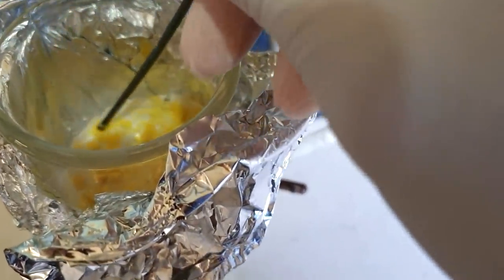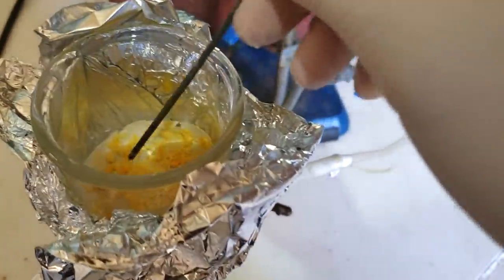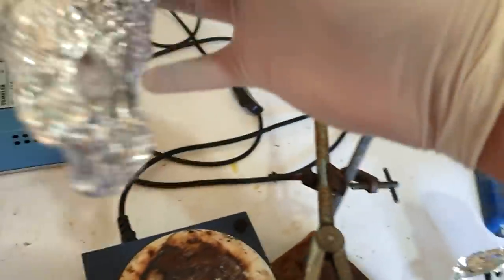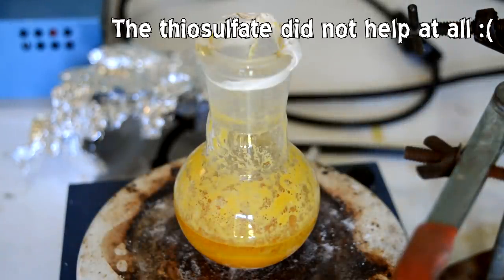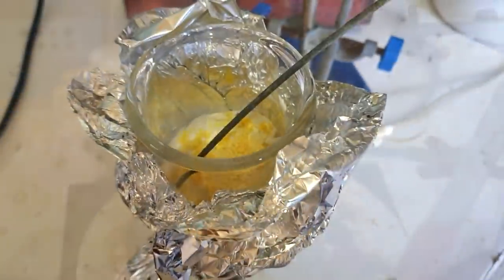This isn't all of it. I've still got quite a bit more in the flask. This is just a test to see if it actually stayed in the filter paper. Try and get some of this color out. I'm just going to add a little bit of thiosulfate to this water solution above the orange. Hopefully that takes some of the color out. And then we'll filter the rest off and hope the rest of it crystallizes just like this.